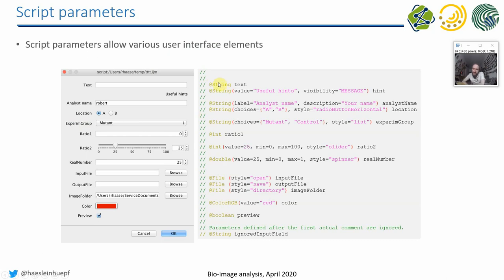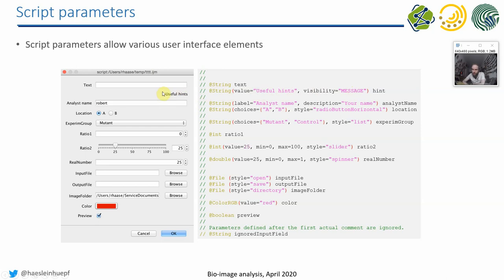So you can, for example, say, okay, I want to have a variable called text, where I put a string in. So this is how this field will look like. If I want to put a message here, useful hints for the user how to use the dialog, you enter it like that with the visibility message. And then you can put a string in here. And you can have integer numbers, and you can have double position floating point numbers into this field.